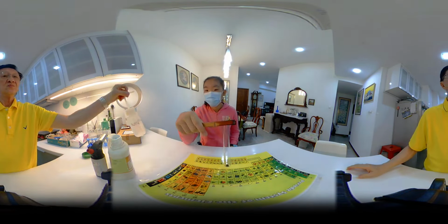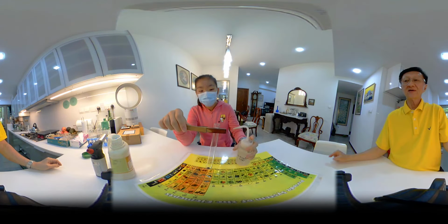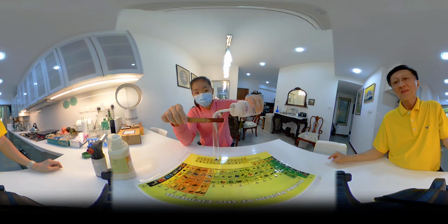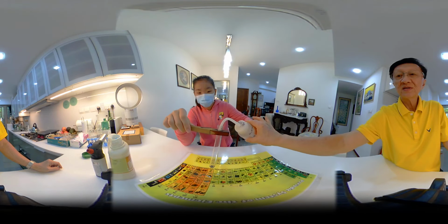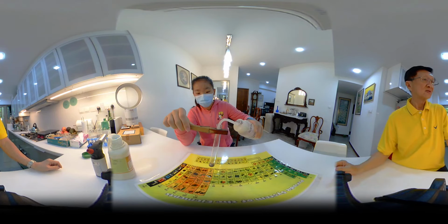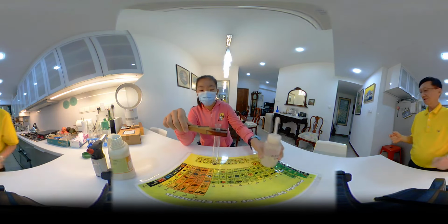And then you pump this inside it. Like that, squish, yeah. Okay, and then shake.